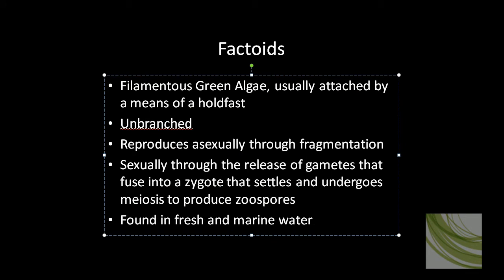Eulethrics is an unbranched filamentous green algae that you find usually in clear running water, attached to something through the means of a structure called a holdfast.